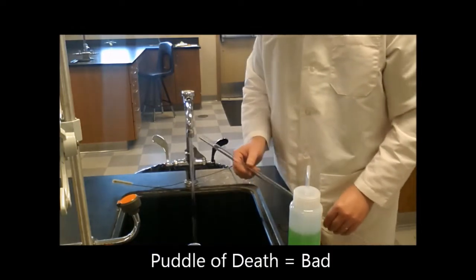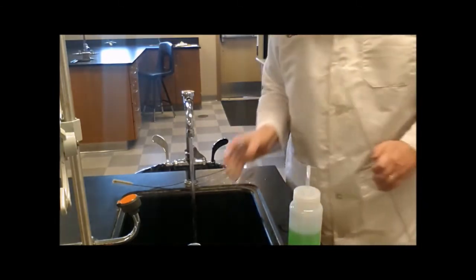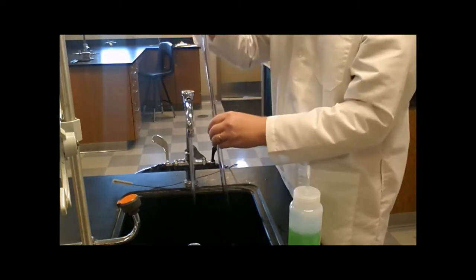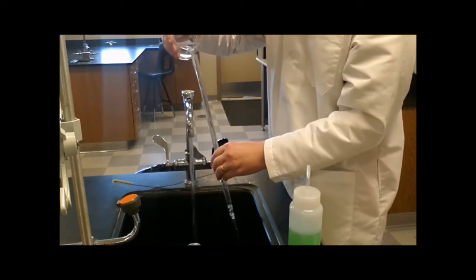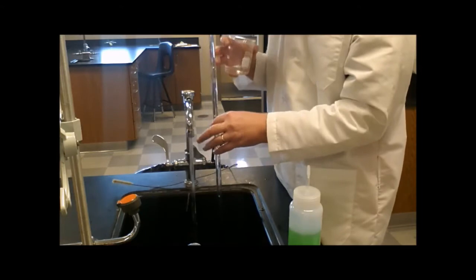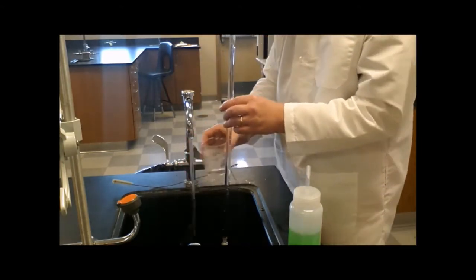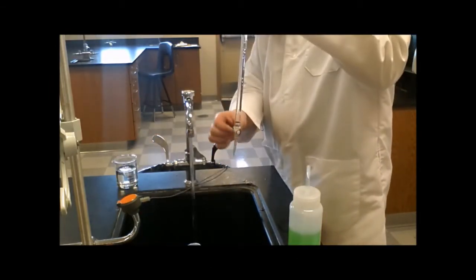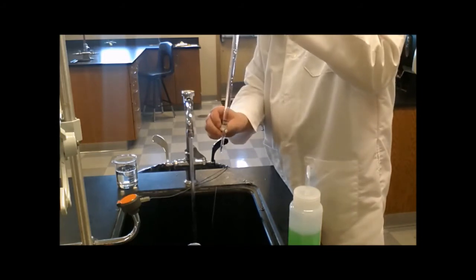So instead of jamming the Buret underneath the faucet, get a beaker, fill the beaker with water, and holding the Buret straight up and down over the sink, pour the water into the Buret via the beaker and fill it up that way. That way, if water rolls down the sides of the Buret, it goes into the sink and doesn't make a big puddle of death on the floor. So you want to rinse the Buret out. Remember that if you don't open the stopcock, nothing will come out of the stopcock. So you want to clean the stopcock too.